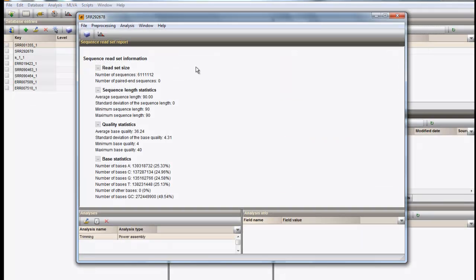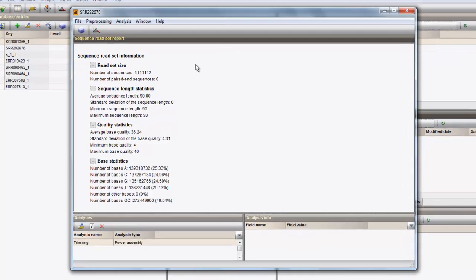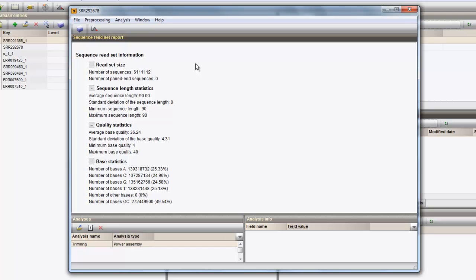From the Sequence Read Set report, some basic summary statistics on the reads present in the dataset are displayed, including information on read set size, sequence length statistics, quality statistics, and individual base statistics.